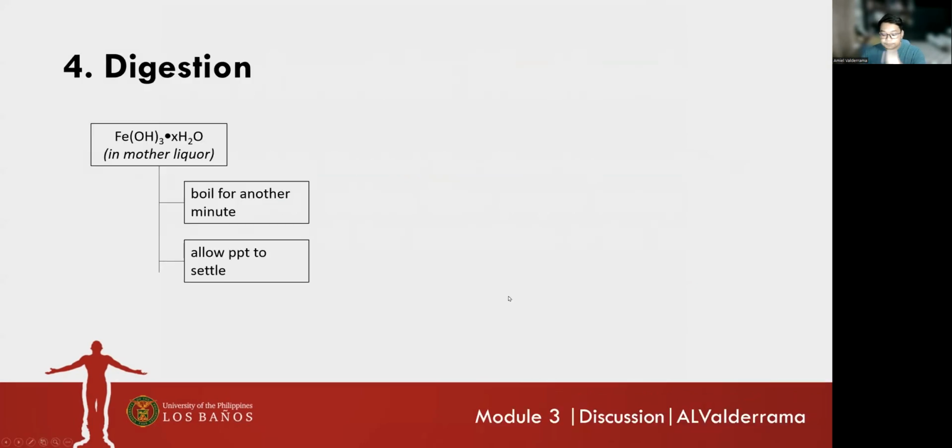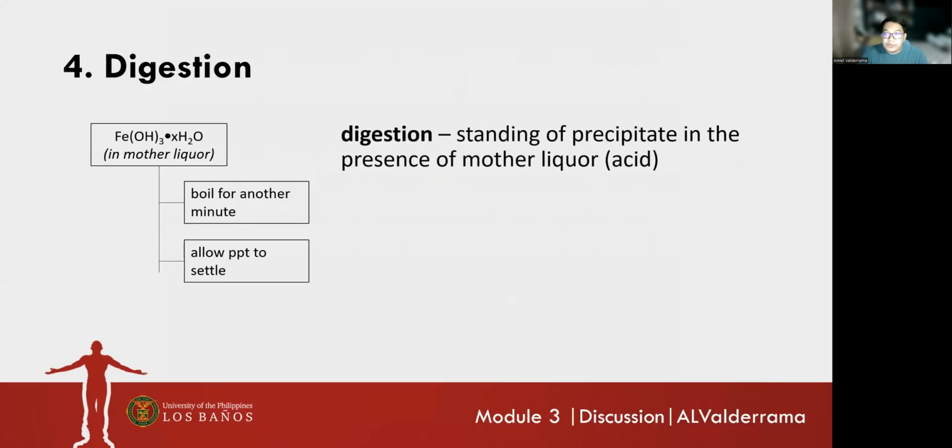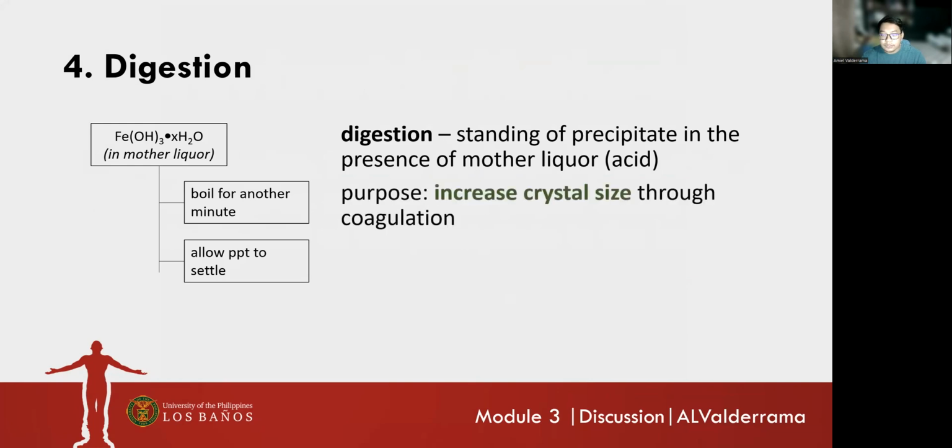Okay, so what is the purpose of this? Digestion refers to the standing of the precipitate in the presence of the mother liquor, which is your acid. And the purpose of this is for you to increase the crystal size via particle growth through coagulation. Okay?